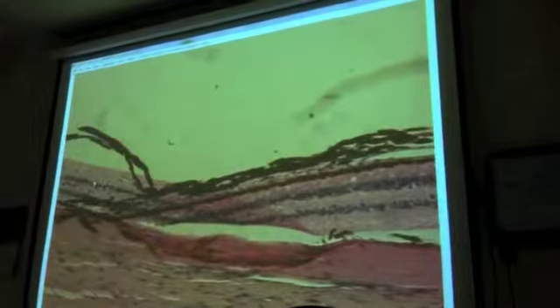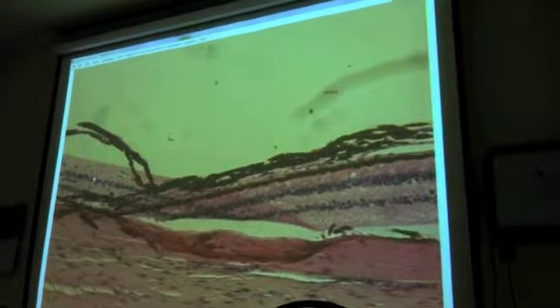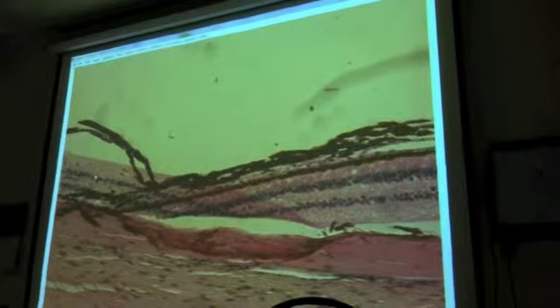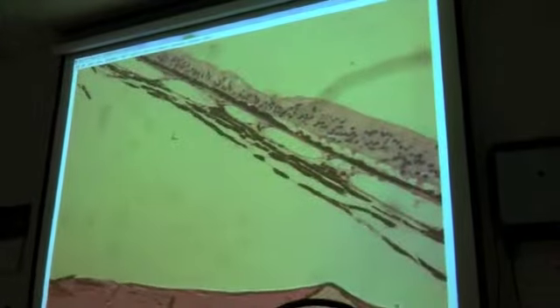We have what's happened here, and I'm just going to interpret this for you because it's odd. The choroid coat in the section has been moved out of where it belongs. But we are getting anterior. And I went around the other edge of an eyeball, or had a different slide yesterday, so I don't like that. I'm going to go across the eye right now.